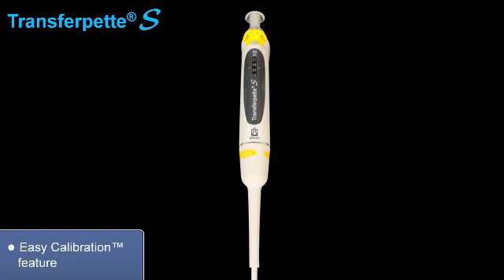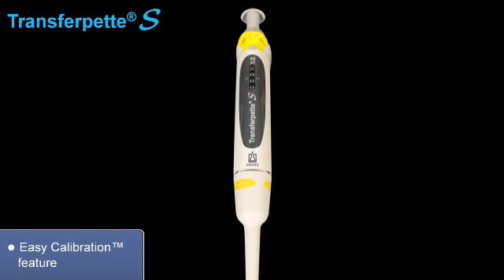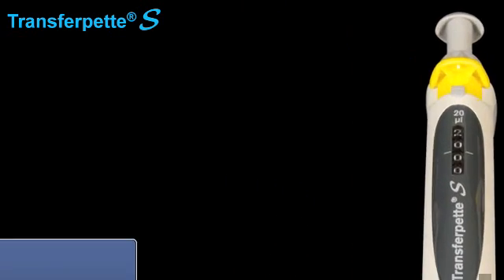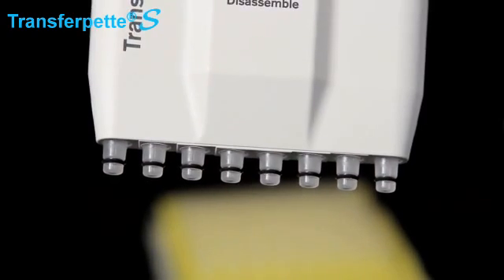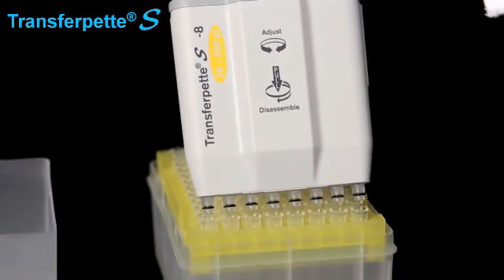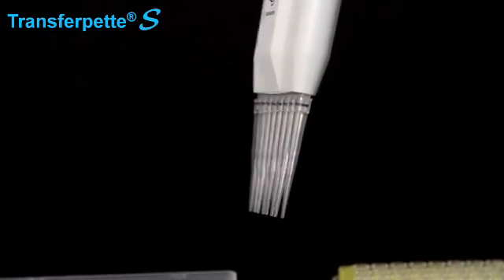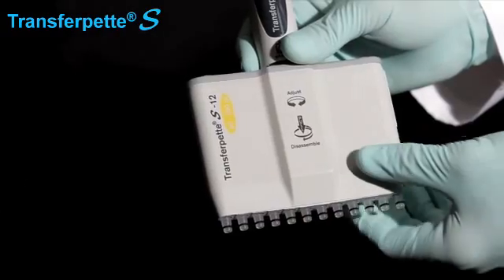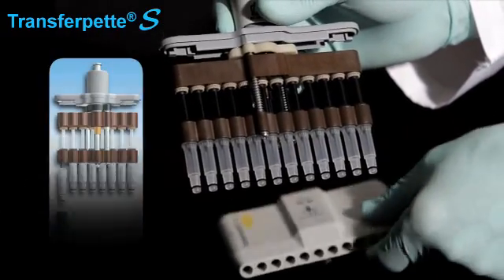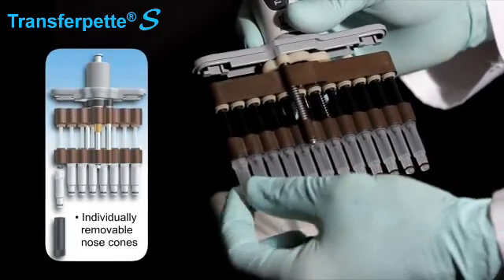The easy calibration feature makes it simple for the end user to perform calibrations and make simple adjustments. Multi-channel models offer the same great features as the single channel models, plus V-rings for broad tip compatibility and low tip mounting and ejection forces. The patented design allows individual nose cones to be removed and replaced, greatly reducing maintenance costs.